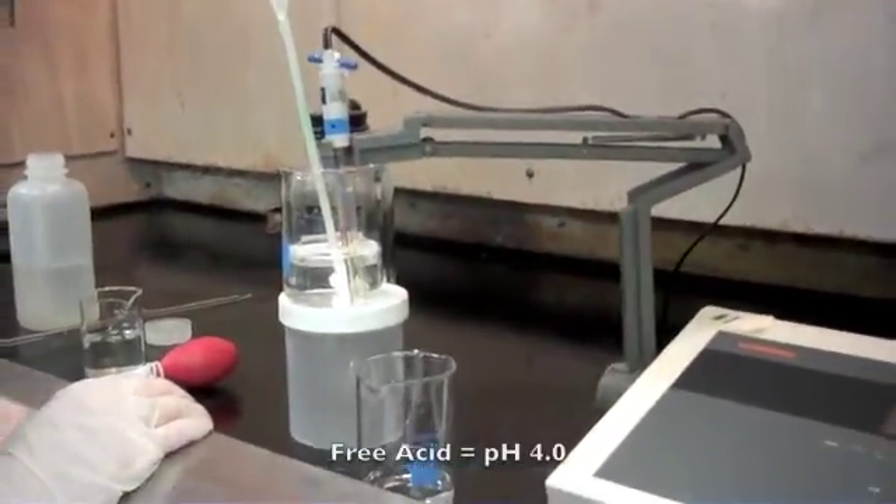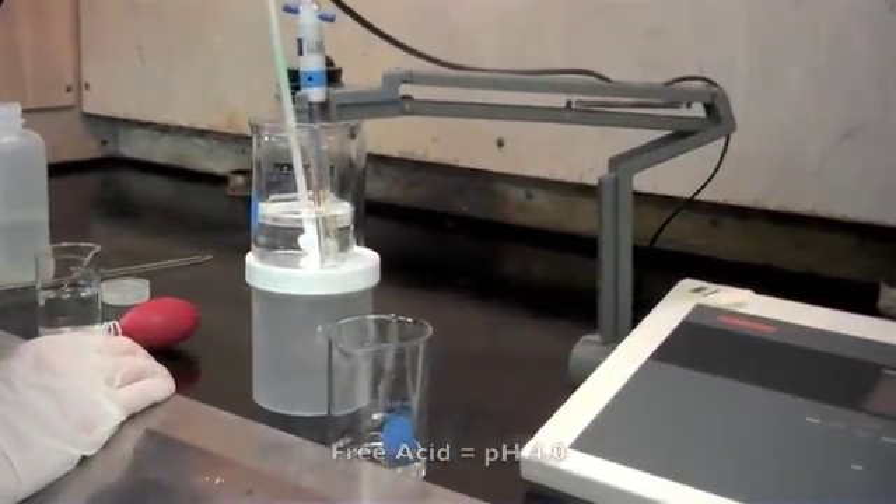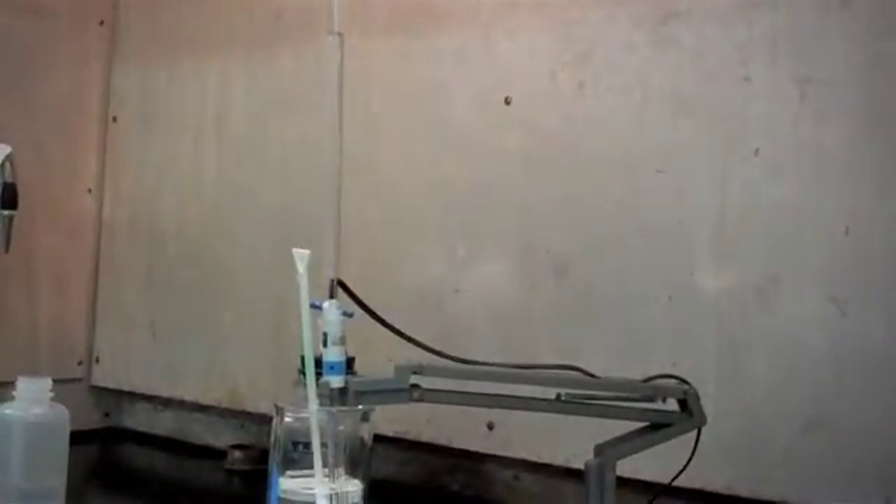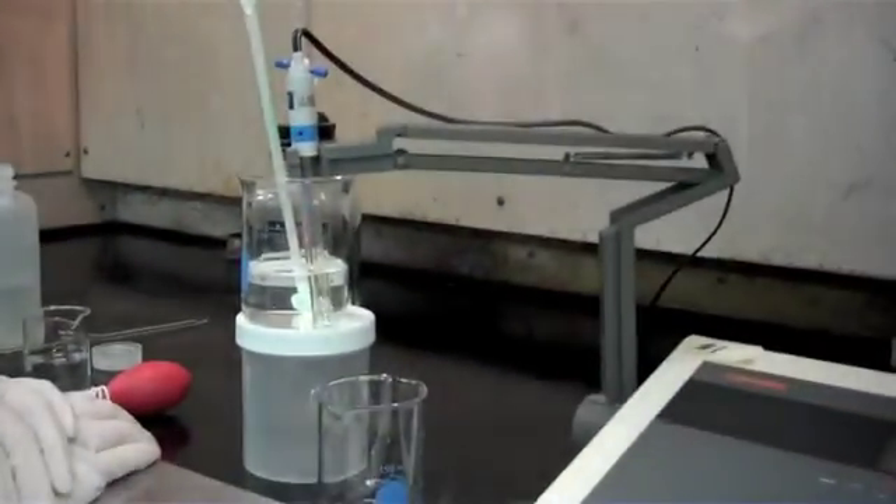And there you have it. At this point we have our free acid at pH 4.0, and we're going to take a reading from our burette, which is 2.5. So our free acid for this sample is 2.5.